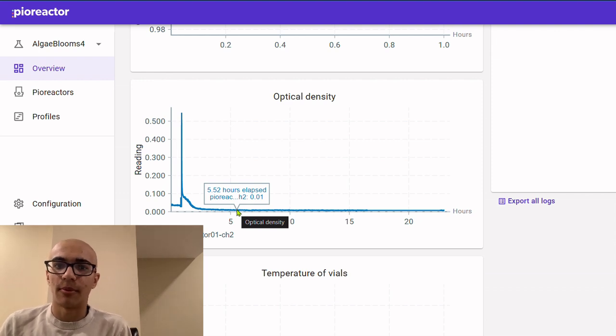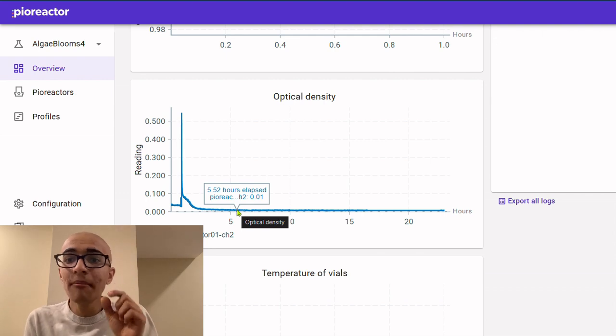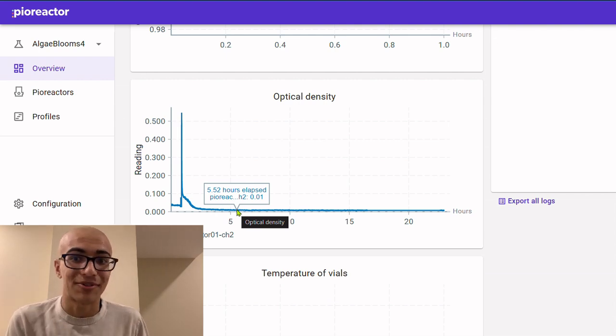Now, the other thing we care about is, well, how long it took to get there. That took 5.5 hours. And yesterday, when I did a test in the morning of chitosan and only adding 1 milliliter of chitosan to my modified clay, it took about 7 hours. So what we're actually seeing is that more chitosan makes the process go faster, which is super, super interesting. This is the data point that I really wanted to see. And now I'm excited to keep pushing it further.